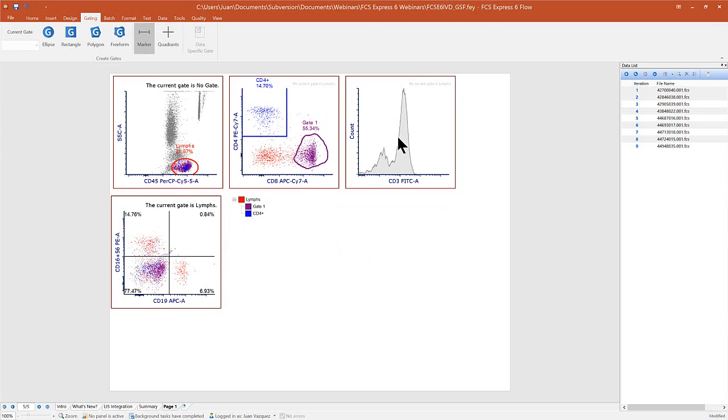If I wanted a marker, I can simply drag a marker in a plot. And as you saw earlier, let's say I actually wanted to link different markers together. I can simply take this and hover it until my cursor turns into a plus sign, and now you'll see that they're linked. Okay, so now rather than have to move two separate markers, I can just move them together at the same time.